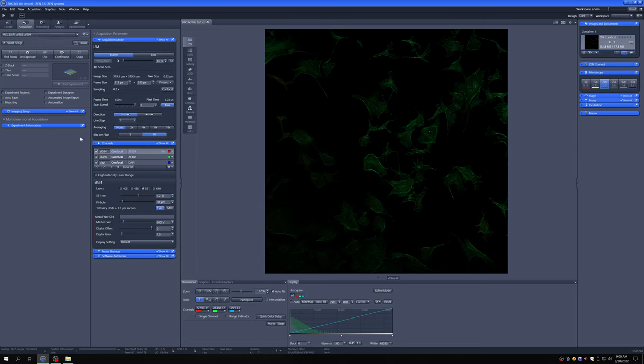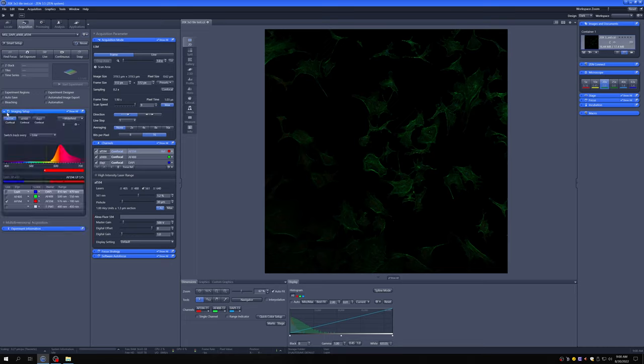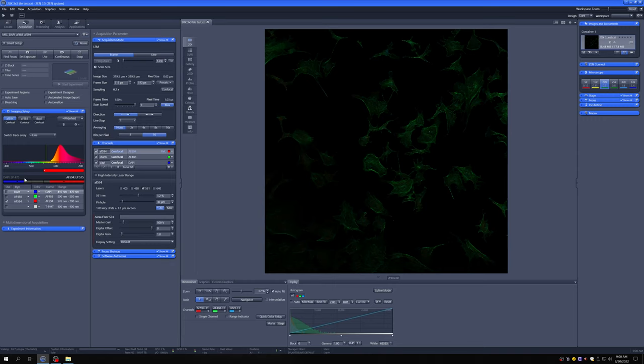So what is happening when this particular setting is loaded on the microscope? So that's described here. You don't need to make any changes here, and I would strongly urge you not to touch anything here, because these settings have been carefully set up to minimize crosstalk. But if you're curious as to what's happening, what's happening in this case is the following.